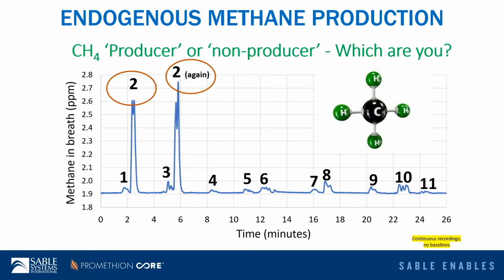Well, just like the mice that I showed you earlier, humans also differ in their methane production. This is a 26-minute recording, and I asked 11 members of our research and development team to exhale a single breath near the methane analyzer. Clearly, person number 2 had measurably higher methane levels in their breath. Well, fortunately, I'm person number 2, so I can share that with you.